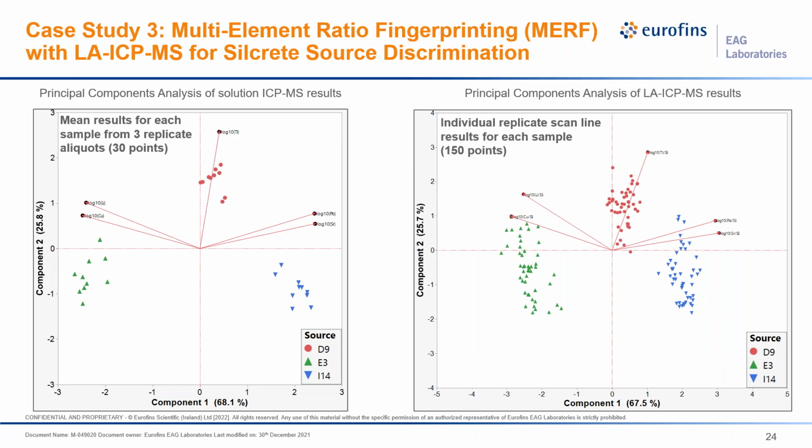So let's just jump right to the results. We can come back to how we got here later. So what you're looking at right now are 2 principal components analyses, or PCAs. PCA is a pretty straightforward multivariate data exploration technique. It's just widely used when you have to deal with more elements than can fit in just a bivariate plot on their own.